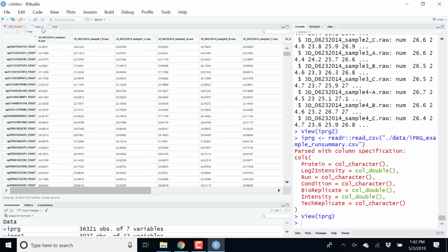One really huge advantage of this one is for missing values. Okay. So I would immediately see if I had a missing value for this protein and that sample, right? Because I would have an NA there. So it becomes immediately clear where I have missing values, and I can easily see patterns in missing values. Do I have more missing values in one sample than in another one? Or do I have a certain protein that has many missing values?